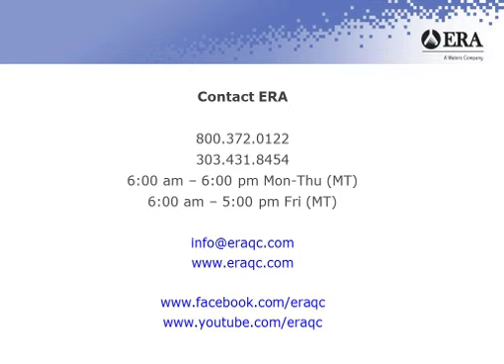So those of you that don't know, IDEXX SimPlate, you're looking for a chromogenic, or actually a fluorogenic endpoint, and there is no comparator available for it. So as I kind of mentioned in the presentation, I would recommend that you run a QC sample along with it. Another thing that will help you out is IDEXX sells a viewing box. We call it a dark box. Basically, you put the fluorescence lamp on the top of the box, and then you look in through a viewing port, and you hold the sample inside the box. It makes it a little bit easier to read SimPlate results.